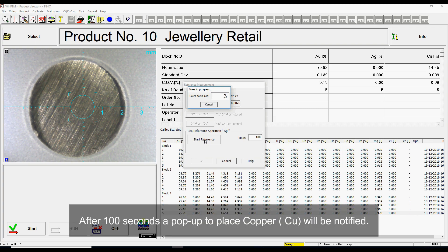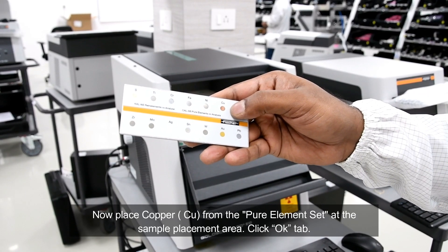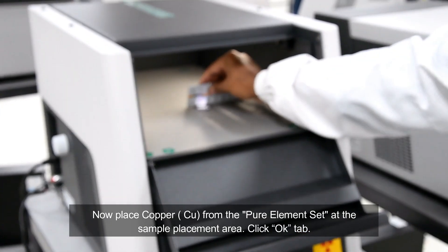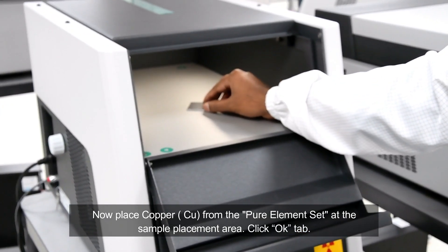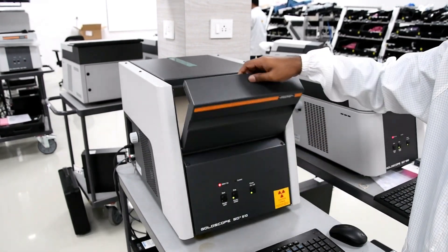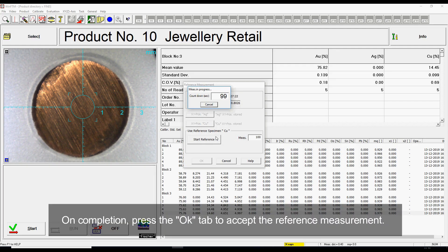After 100 seconds, a pop-up to place copper will be notified. Now place copper from the pure element set at the sample placement area. On completion, press the OK tab to accept the reference measurement.